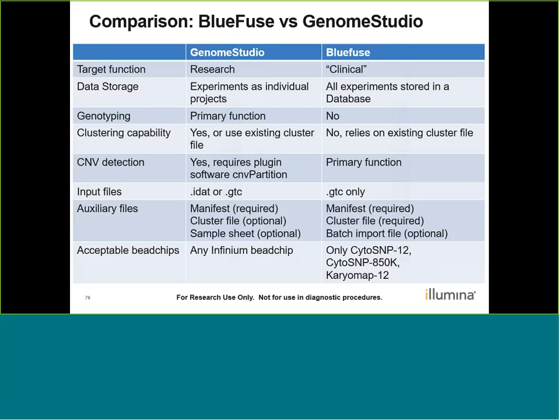We can and need to use and create cluster files in Genome Studio. BlueFuse relies on the cluster files created in Genome Studio. CNV detection can be performed in Genome Studio if you use the CNVPartition or just at a very high level approximating in the Illumina Genome Viewer. But in BlueFuse, that's the primary function. Input data files for Genome Studio can be either IDAT or GTC, and we'll discuss the GTC files in just a moment. BlueFuse uses only GTC files.